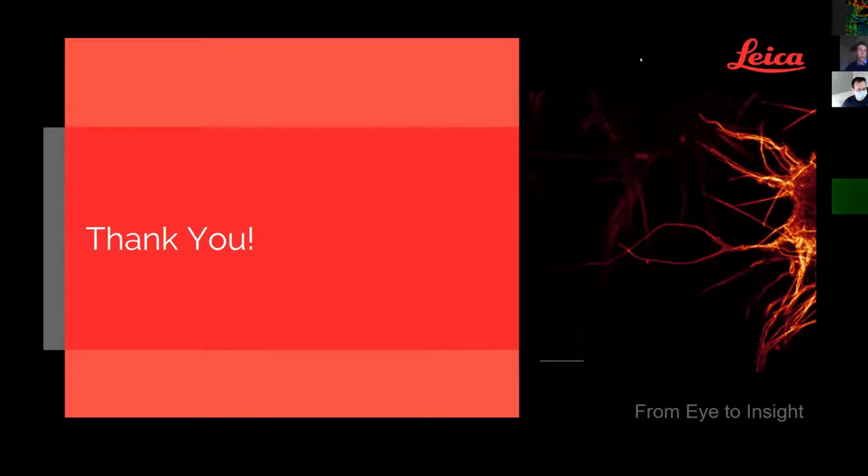In principle, what we can do is we have a glycerol objective, which makes the whole PSF much more adjusted to tissues, especially thick tissues, and which also has a motorized correction collar, which means that you can adjust it to different Z positions, different depths in your sample. And then you can also get a nice resolution improvement deeper in your sample. In principle, the lifetime is not affected by how deep you are in your sample.